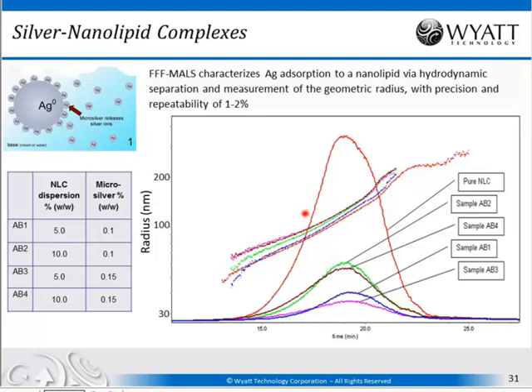And so if you need to look at nanoparticles or combinations of nanoparticles and macromolecules, FFF is really the ideal characterization and separation method utilized together with the light scattering.